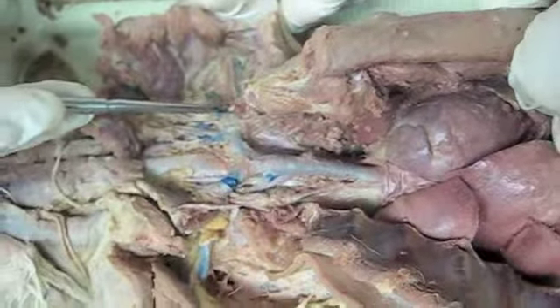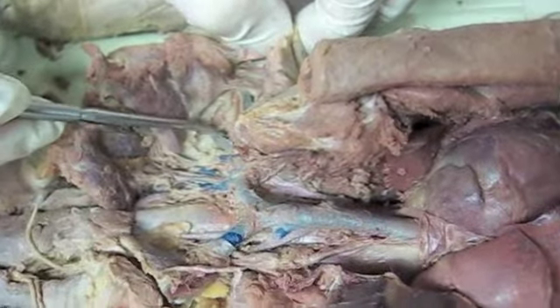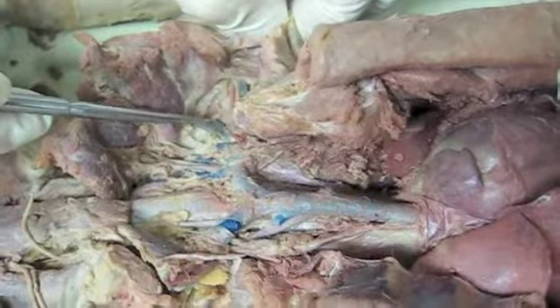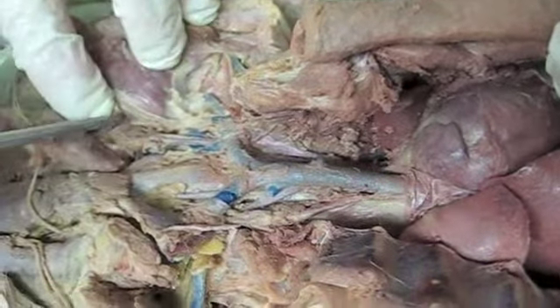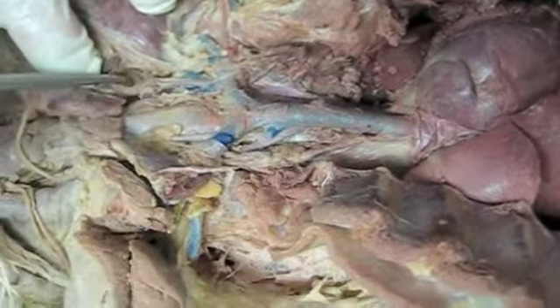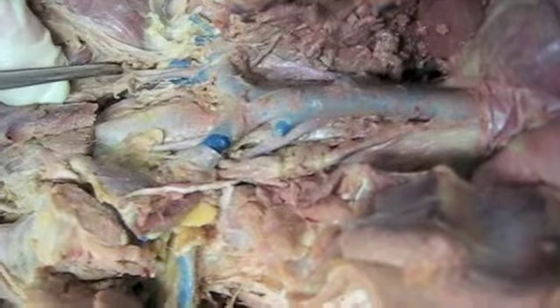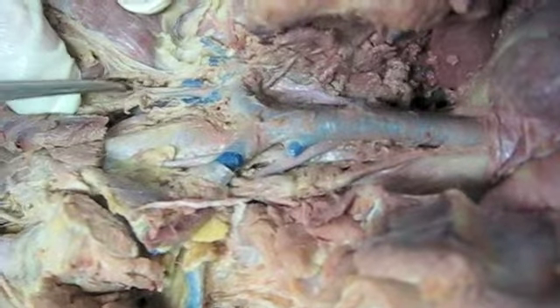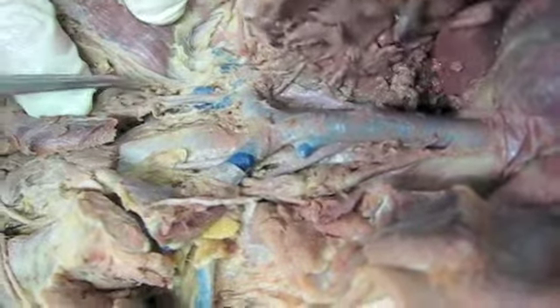The only big branch that's coming off here and going forward is going to be the subscapular vein. And then a little thing that's not very well injected coming off the external jugular up in this area is going to be the transverse scapular vein. There'll be an artery that parallels it, so that'll help.